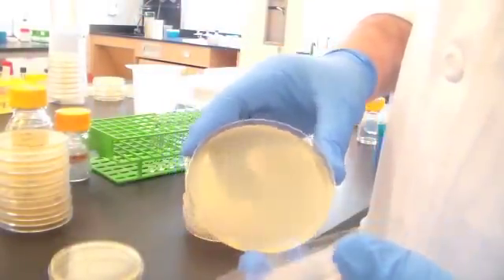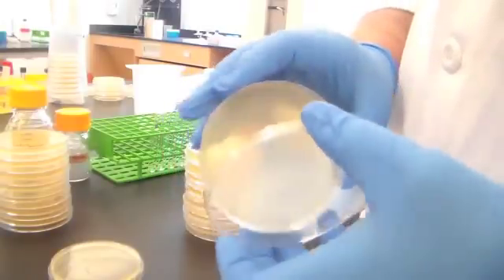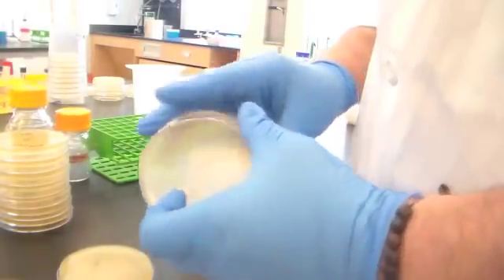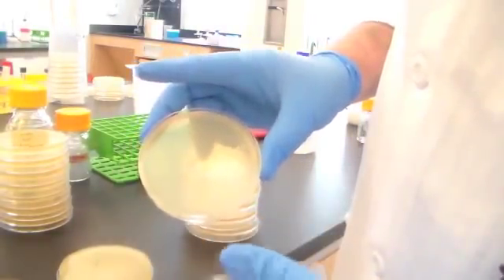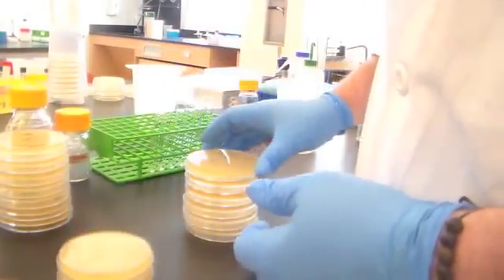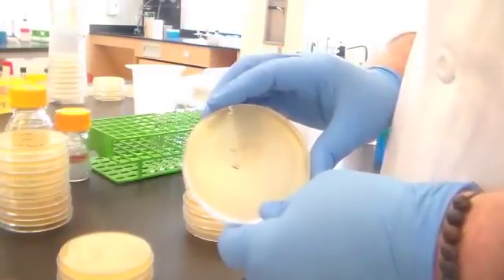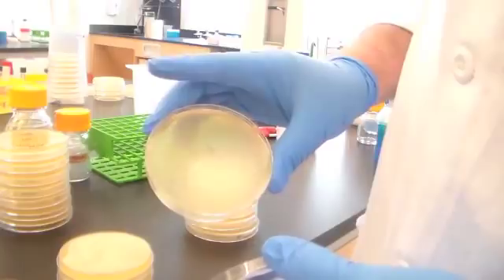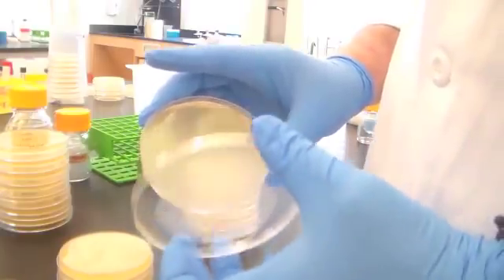At 10 to the minus 1, it's practically a lawn. Many too many colonies to count. As a matter of fact, the colonies are touching one another. Here's the 1 to 100 dilution of the culture that I did yesterday, and again, the colonies are touching one another, too numerous to count, TNTC. At the 1 to 1,000 dilution, you can see that there are fewer colonies, but there are still way too many to count.